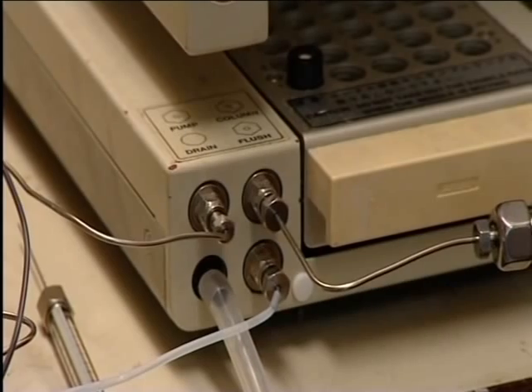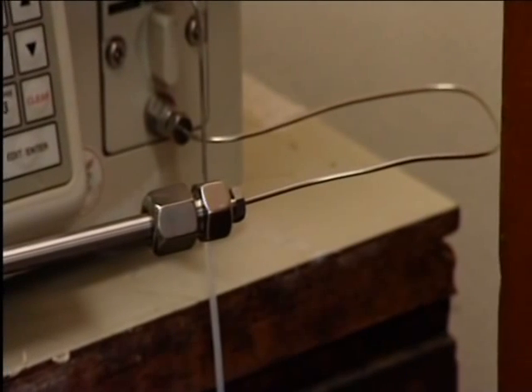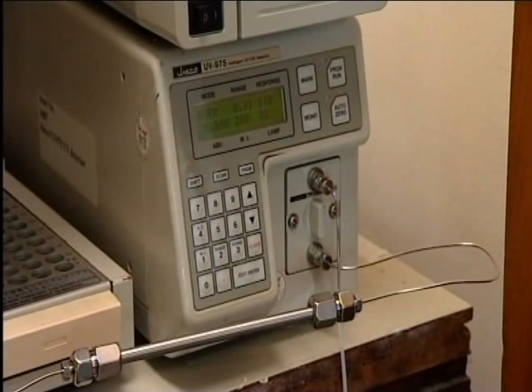The pumps force the mixed solvents through the column. The solvent emerging from the column and carrying the separated components of the mixture passes into the detector. Here, a beam of ultraviolet light shines through it. This light is set at a wavelength that is absorbed by all the components to be separated. When the detector reading drops, a component that is absorbing UV light is coming out of the column and passing through the detector.